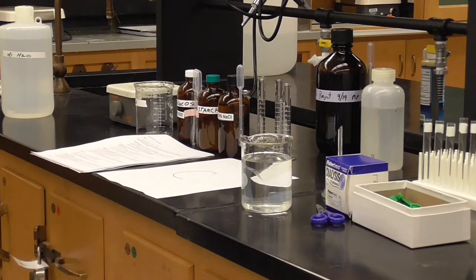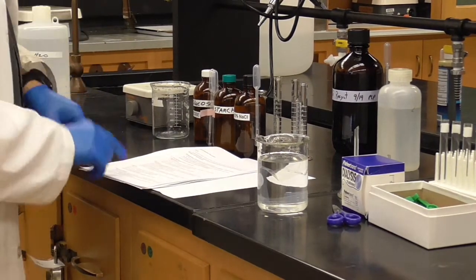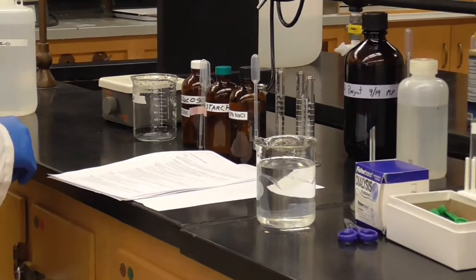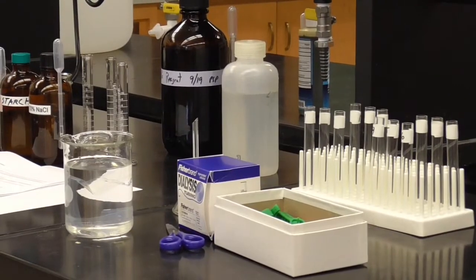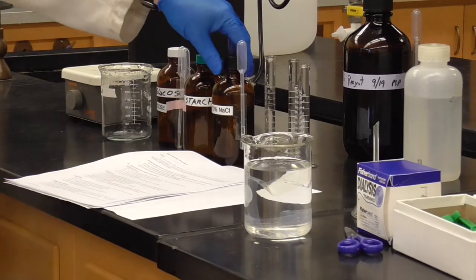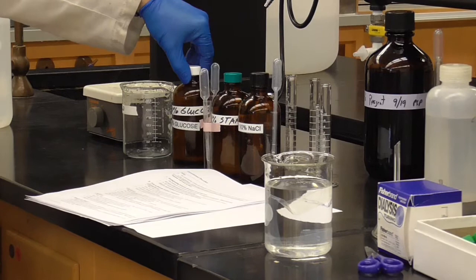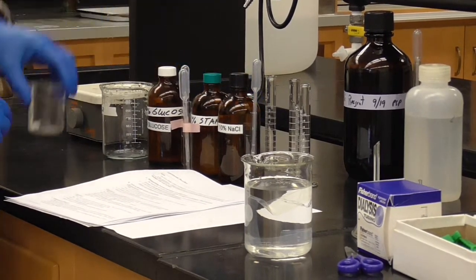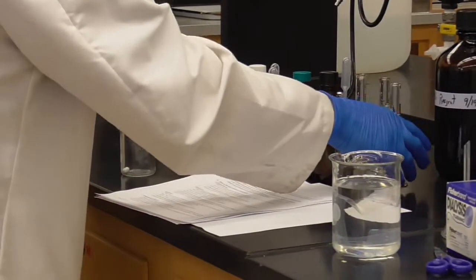Okay, part C. We finally get to the osmosis and dialysis section. To start us off, I'll talk about that in just a second, but let me get the first step done first before I discuss the point of this. It says obtain 12 test tubes. We've got our 12 test tubes. But step 2, combine 10 milliliters of, guess what, the same solutions we just did in part B. Sodium chloride 10%, starch 1%, and glucose 10%. We're going to combine 10 milliliters of each one into a beaker and mix it all together, so we're going to have all of them present all at the same time.